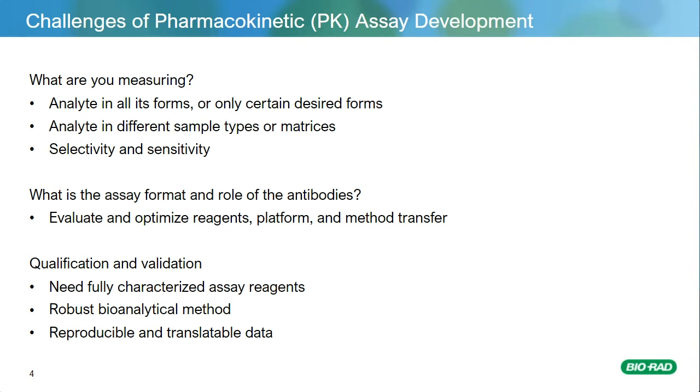And then finally, we need to step back and look at the wider scope of the project. What is the study that these antibodies are going to be used in? What's the likely total volume of antibody that will be needed to last the duration of that study? And what level of characterization, quality, and QC testing will these antibodies need to go through to satisfy the requirements of the team designing the assays to ensure they have the robust assays they need for their preclinical and clinical work?